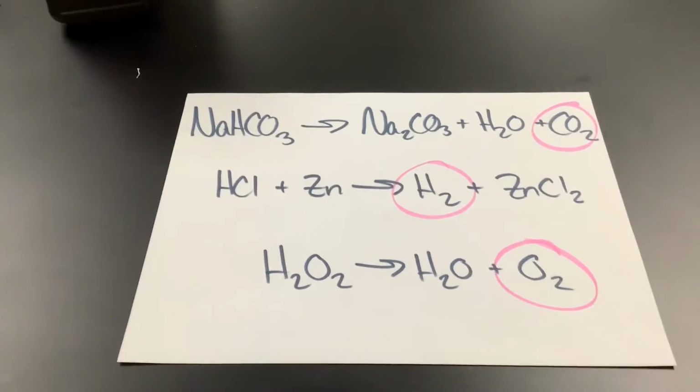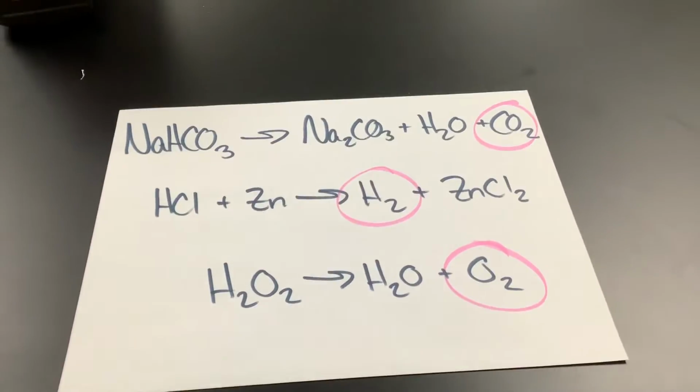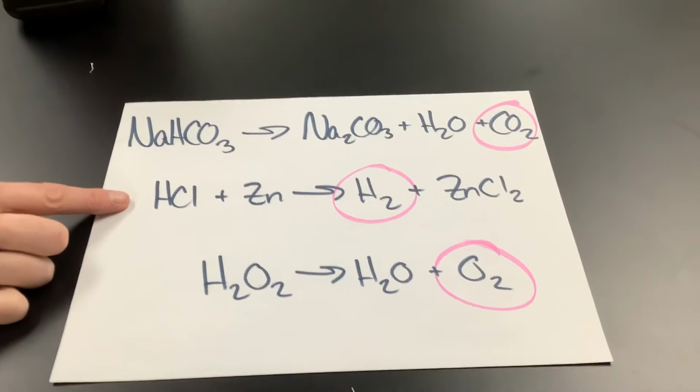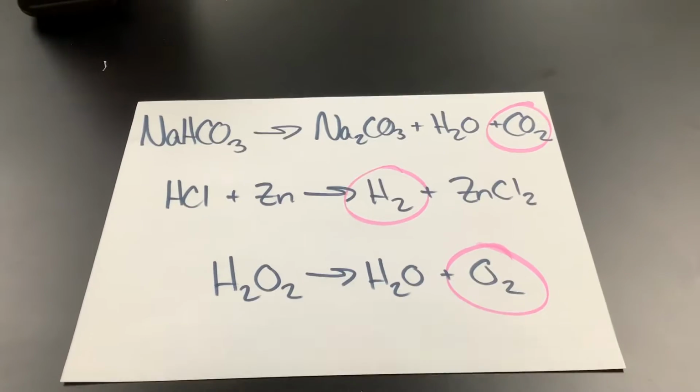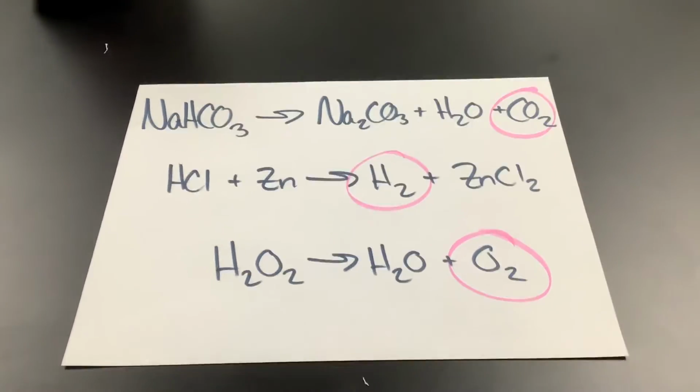Let's go in order, so let's do this next one. HCl plus zinc yields hydrogen gas and zinc chloride. What kind of reaction type is this? Out of the 5 reaction types that we looked at, what type is this?